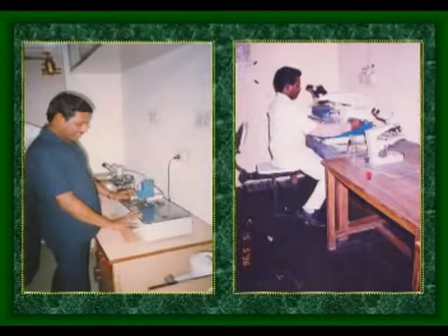Then with this ultramicrotome, the main point is that it can take sections without manpower. So before starting the section, you adjust all the parts, then you press the ultramicrotome system, and automatically the sections come out as a uniform sequence of thin layers. The only thing is you have to select the sections.